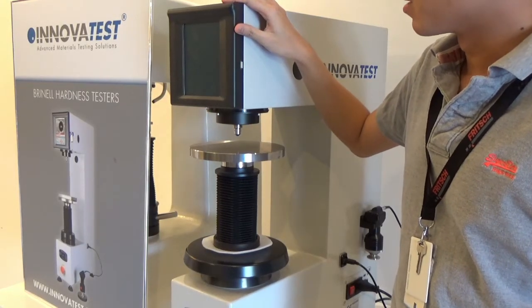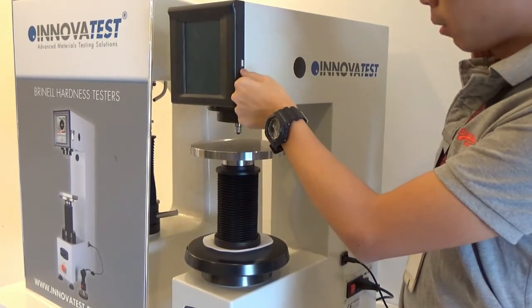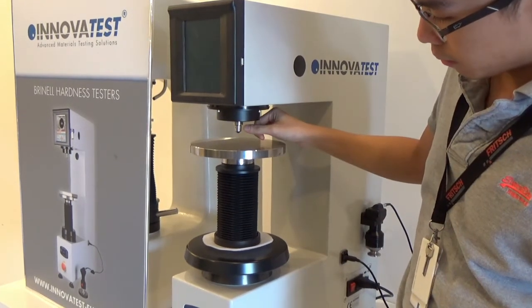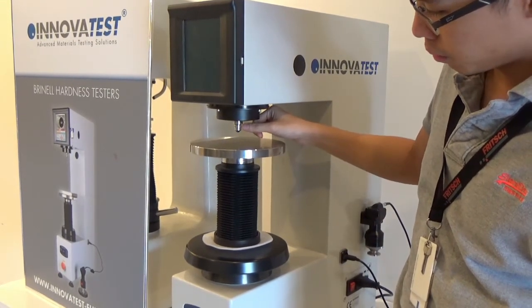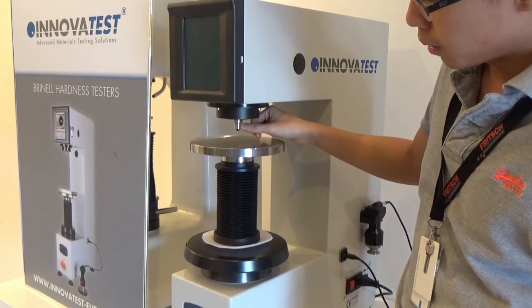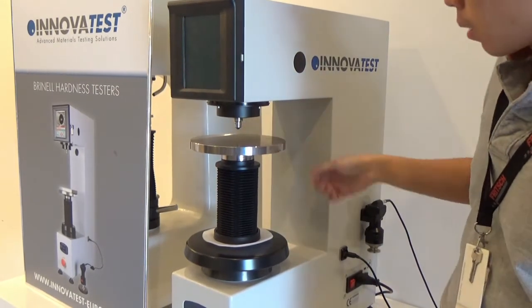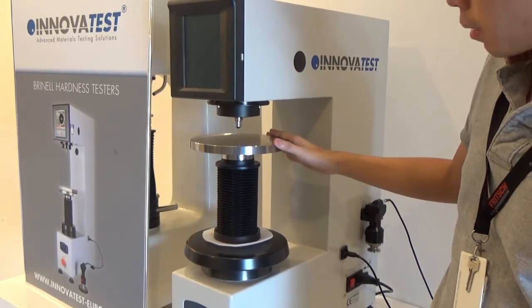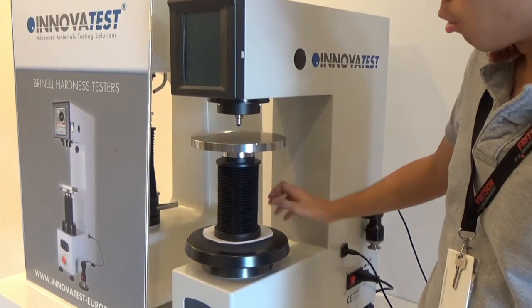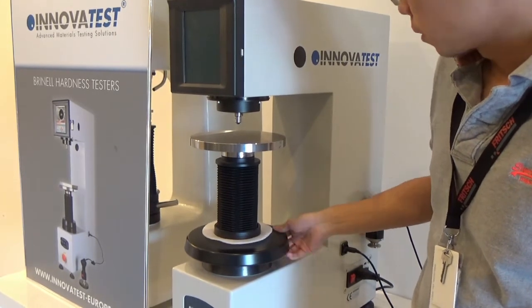We have the touch screen panel over here, and there's a USB port for data transfer. This will be the indenter, whereby you can change it depending on your requirement — it is available in 10 mm, 5 mm, as well as 2.5 mm ball. This will be the sample stage for you to place your samples, and this will be the spindle whereby you can turn up and down to adjust the position.